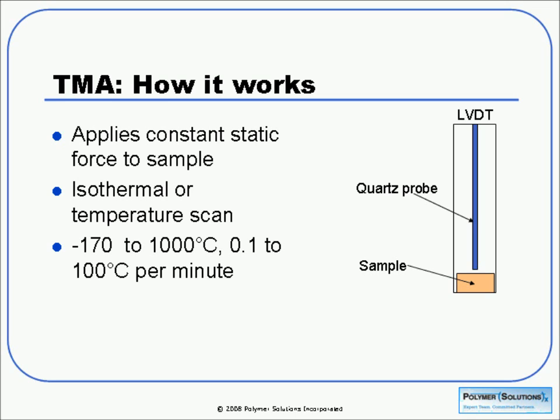So I want to touch briefly on a couple of other techniques. One of those is thermomechanical analysis, or TMA. You see an instrument for that here. Sample size, again, is fairly small, maybe a 1/4 inch diameter and probably between 2 and 10 millimeters thick.